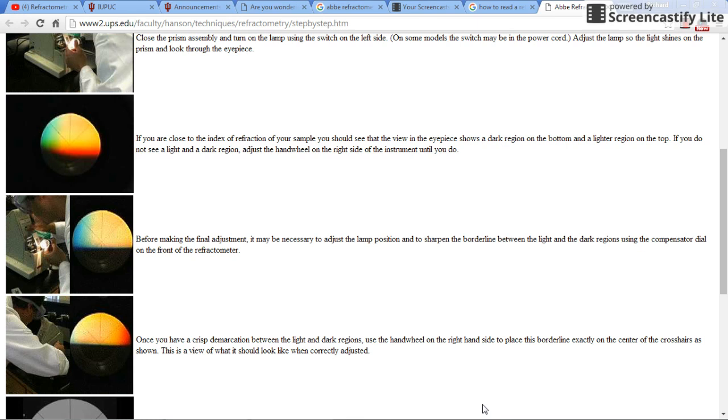All right, we're here for lab number 8, which is the identification of a petroleum hydrocarbon. You're going to learn 2 new techniques, which are boiling point and refractive index. We've already done the melting point of a solid, but if you have a liquid, you're going to have to find the boiling point of that liquid. You can still use that physical property to identify a compound.